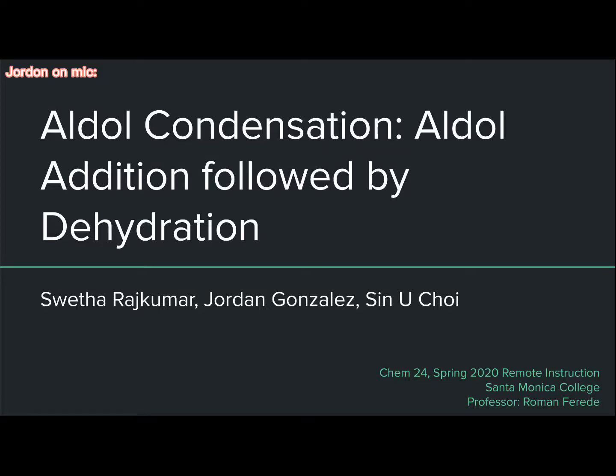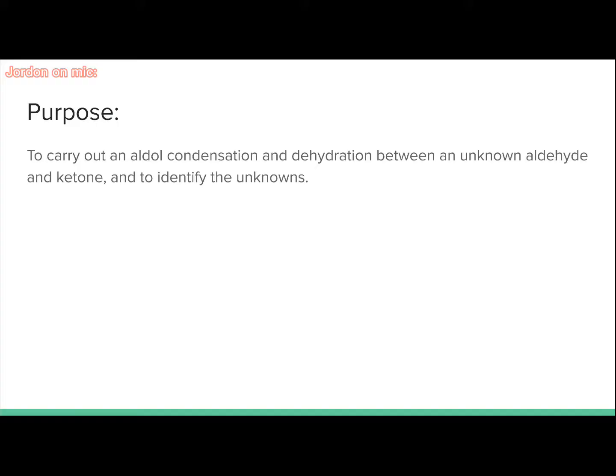Aldol addition followed by dehydration. The purpose of this lab is to carry out an aldol condensation and dehydration between an unknown aldehyde and ketone and to identify the unknowns.